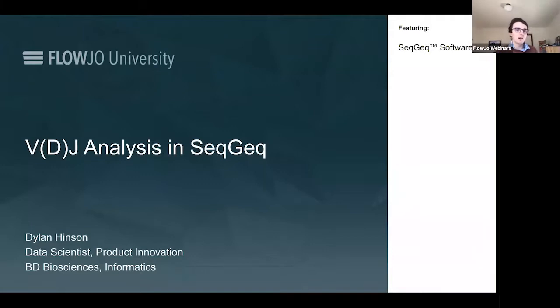Hopefully, we're all here today to see a VDJ analysis done in SeqGeq. And I should mention, it's a more advanced workflow. So if you're not familiar with SeqGeq, this probably isn't a good place to start. I'm going to skip over some of the basics.